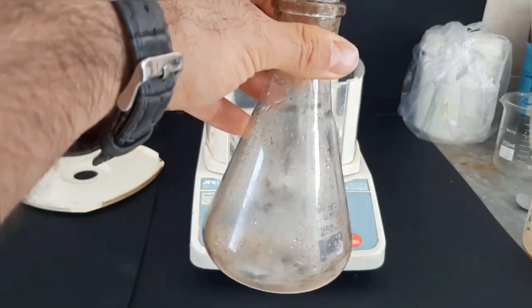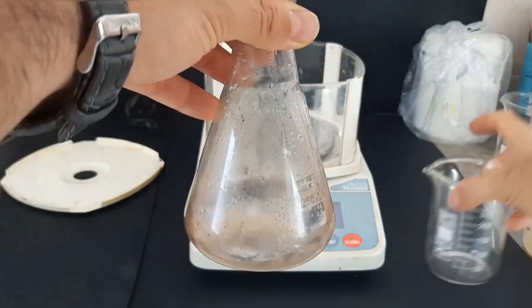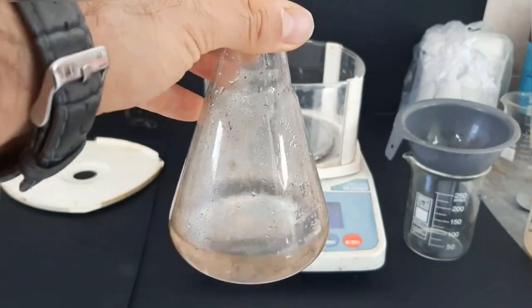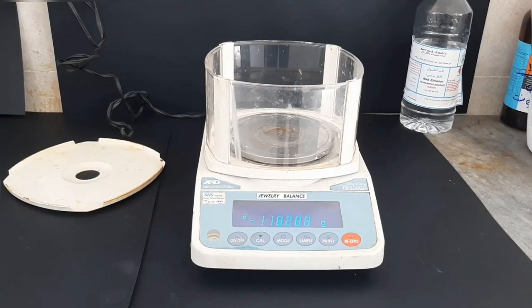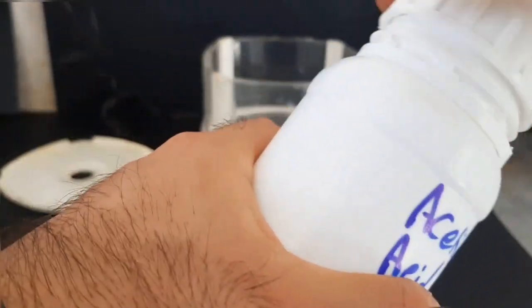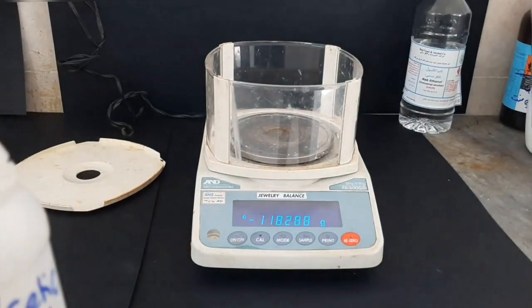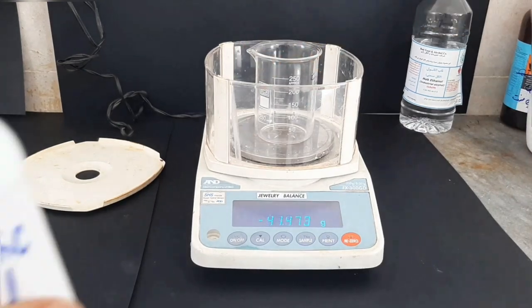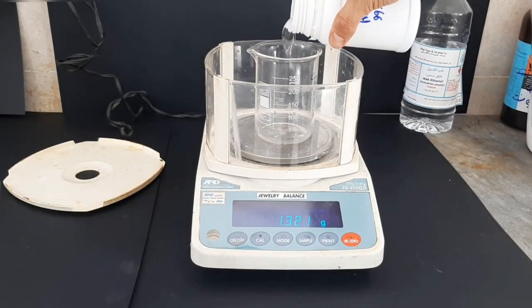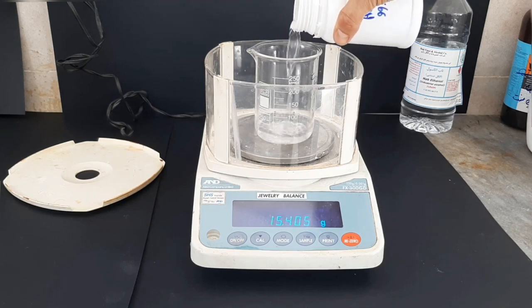So I decided to use the equivalent of 1 mole of material. So I'm weighing around 63 grams of ethanol. This ethanol is an industrial grade sample and has 90% purity. Molecular weight of ethanol is 46 grams per mole and we need 12 grams of ethanol in excess. So that adds up to 63 grams.